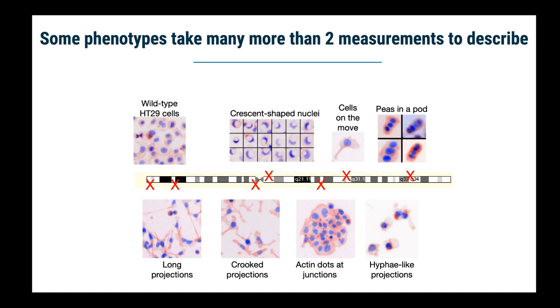There probably are measurements that would help me look at all of these different cell phenotypes, but I certainly don't know the names of them off the top of my head. I couldn't tell you which measurements are the ones that are going to distinguish all these different classes of cells. And frankly, there's no reason for me to have to do that. As long as I, the biologist, can tell the difference between them and know what the classes are, in the same way that with CellProfiler we talked about the computer doing the part that it's good at in doing quantitative measurements, here with the data analysis, we can let the computer do the part that it's good at, which is now taking this giant summary of measurements and figuring out which are the ones that are actually important and which are the ones that find the objects we care about and the classes that we care about.